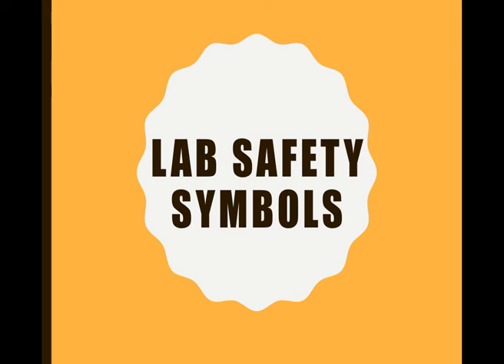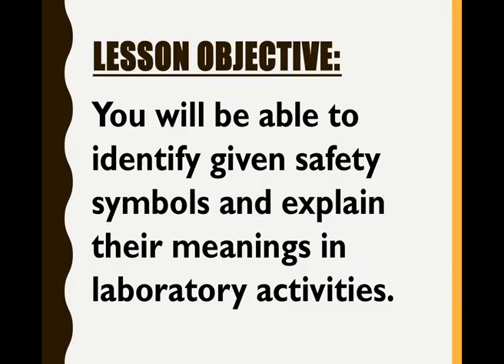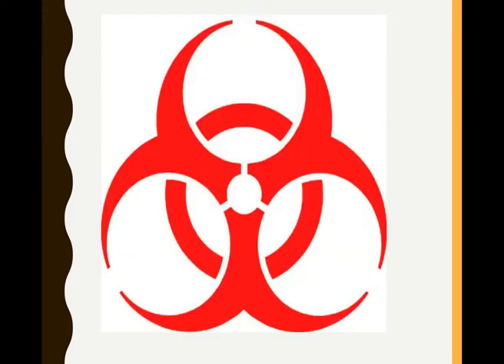Today we're going to start to talk about lab safety symbols. What I would like you to do is first guess what you think the lab safety symbol means, and then we're going to talk about what it actually means. By the end, you should be able to identify what the lab safety symbols are and be able to tell me exactly what they mean.